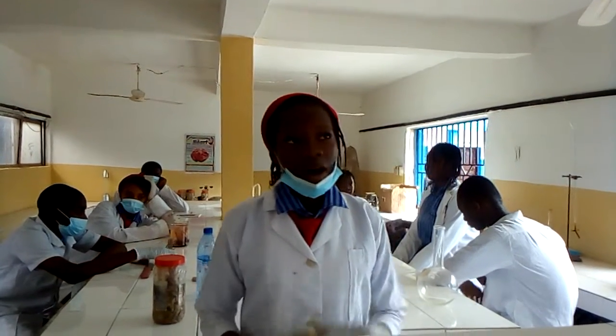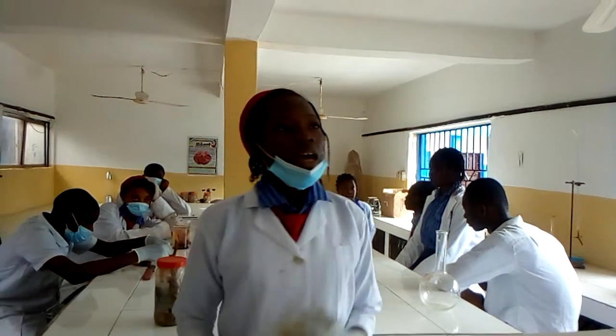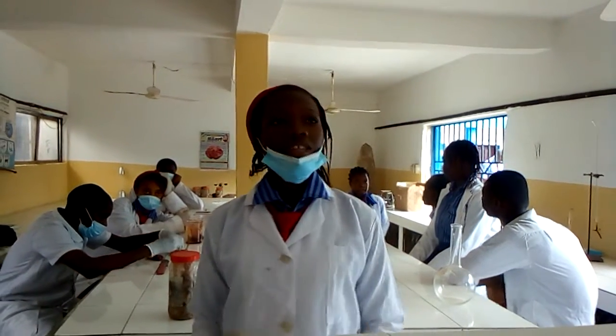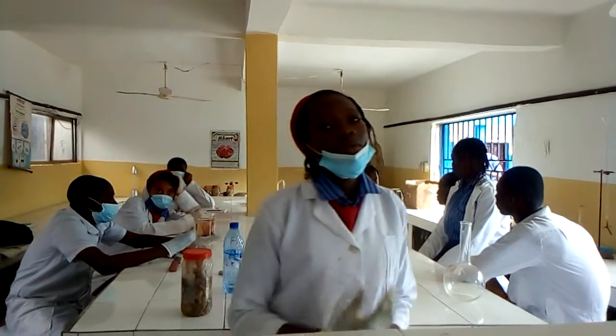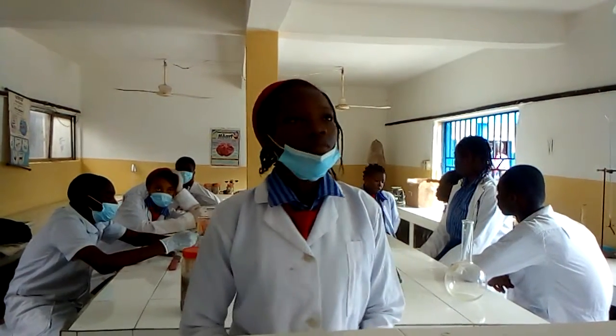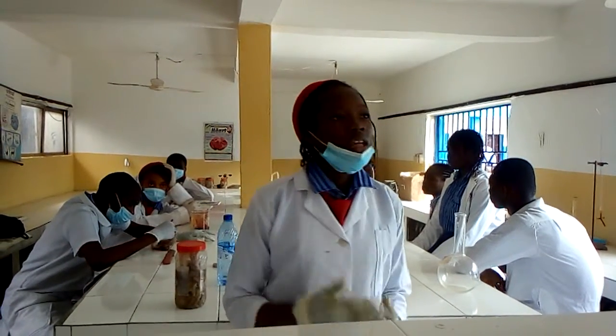The study of mammals is a very important part of biology because human beings are mammals, and in studying a rat or any other mammals, we are to a large extent studying ourselves. Here are some of the apparatus needed in dissection. We need the dissecting board, the dissecting pin, the forceps, and the scalpel.